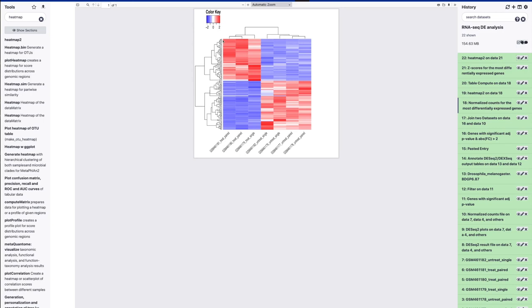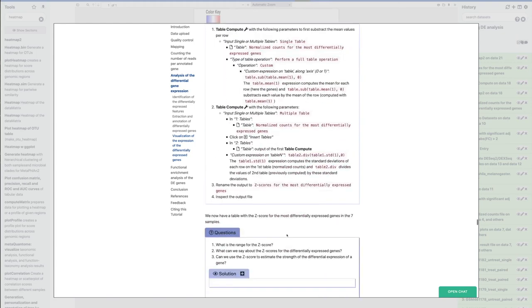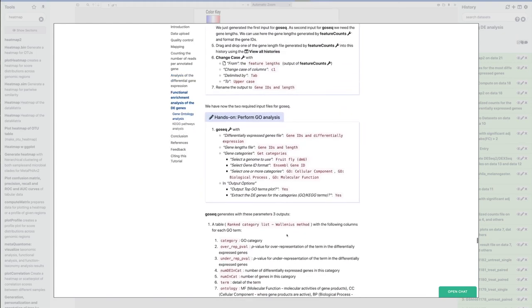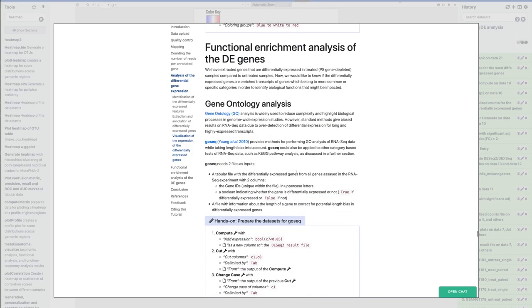Why are they clustered, do they have similar expressions and things? To help doing that, you could have a look at these particular genes one by one, getting more information about them, looking at different databases. But another way to help you do that is by doing what we will do now, which is functional enrichment analysis, and knowing if they come from similar categories or belong to similar biological functions. And it's what we will do now.